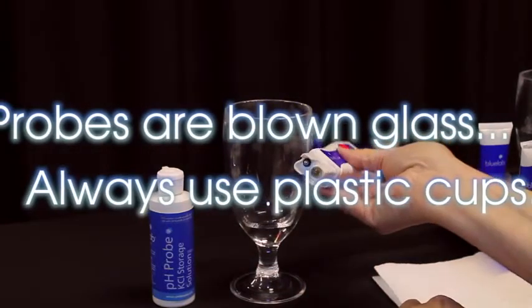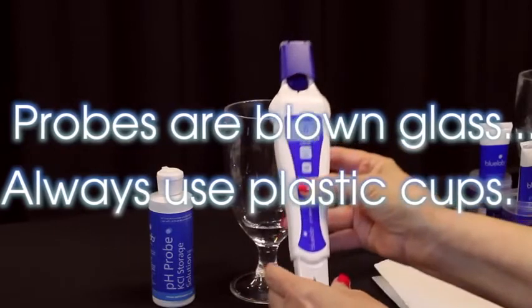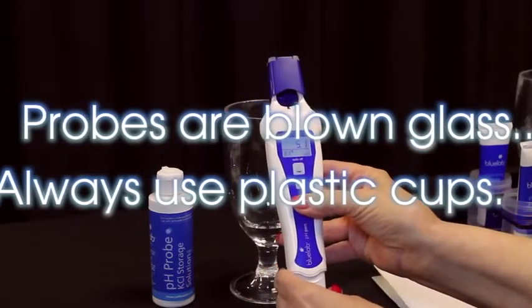pH probes are blown glass and are fragile. When calibrating, always use plastic cups. Glass shot glasses can increase the risk of breaking the pH probe.